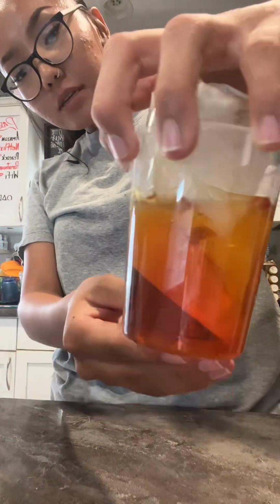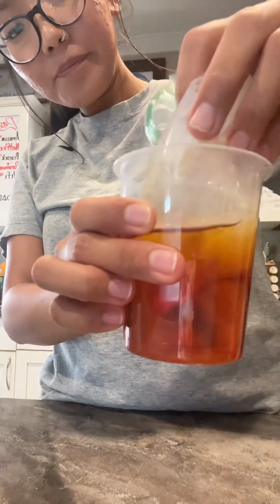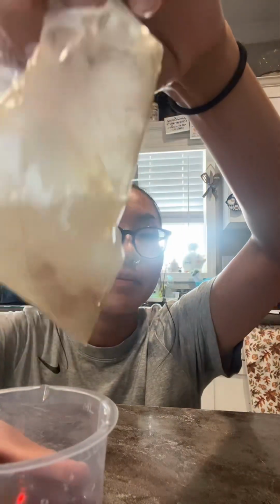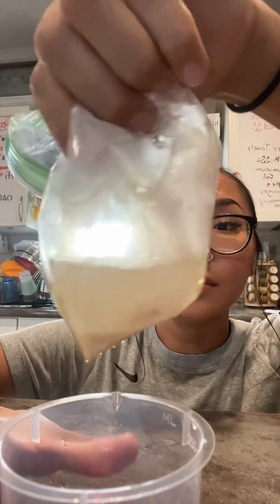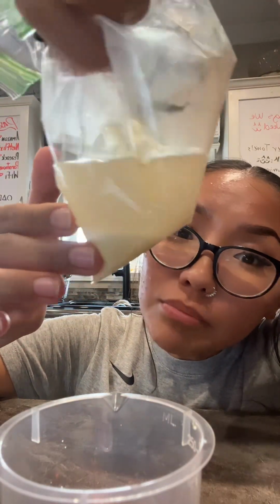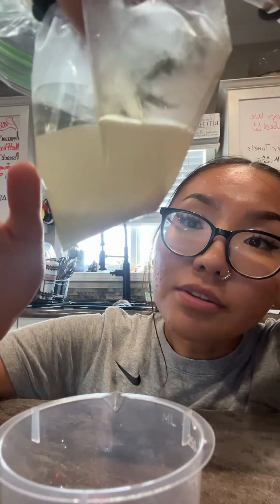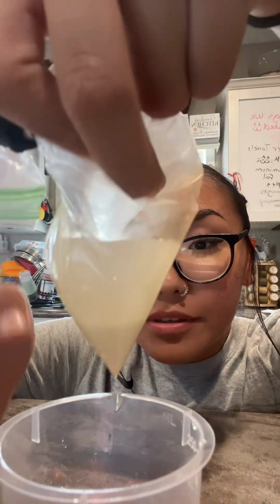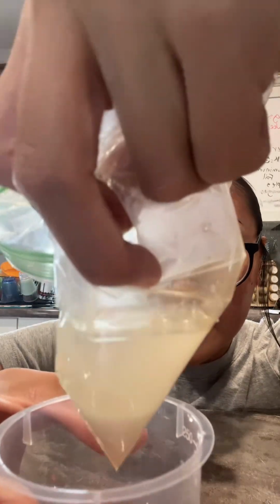So it's sort of like a yellow brownish color, kind of looks like tea. Then if I look at the bag, I don't know if you can see it, but it has that sort of weird color to it. It's kind of purplish, brownish. It's only a little bit though. But it didn't go through the bag, as you can see.